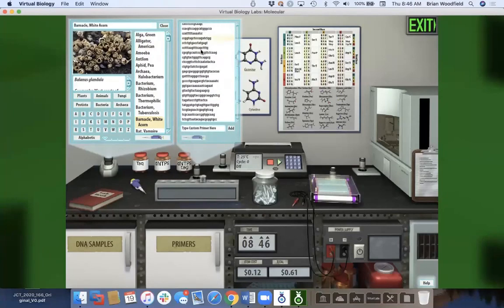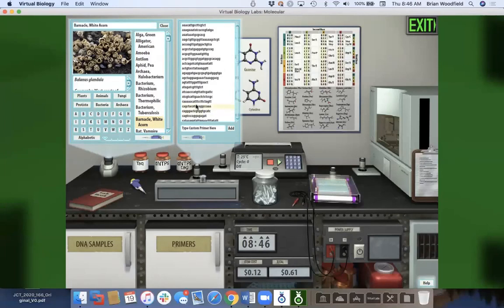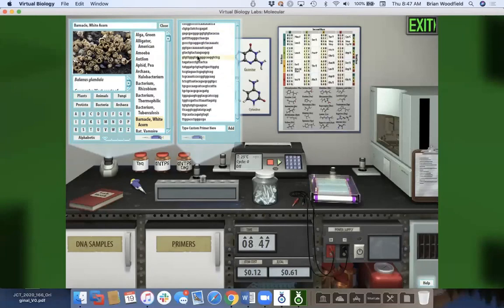And then, based on the species they've picked, we put in the primers they need for the genes that we have for that species. And then we throw in some distractors. And then you can always define your own. So maybe you want to teach them what happens if your primer isn't long enough. Can you amplify multiple genes and get a mixture? And so we allow for all of that. And so you can pick the right primer. Now I have no idea what the right primer is.